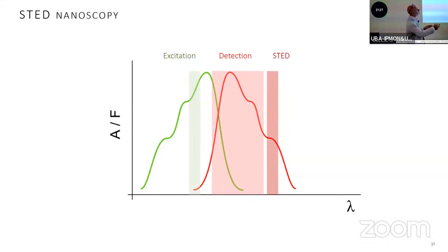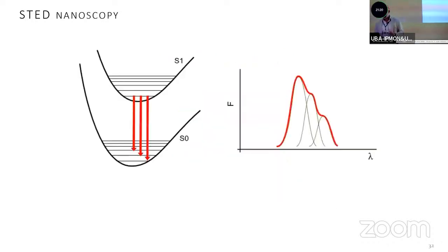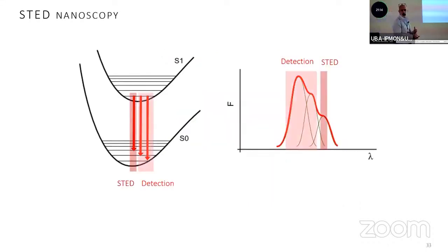another laser. The function of that laser is to bring the molecule down by stimulated emission. So basically, from the 3 transitions that you had for emission, you will use these 2 to detect fluorescence and this one to bring the molecule back down. Okay, so this laser brings the molecule back to the ground state, and you are not watching in that spectral window, so for you, that molecule is dark.